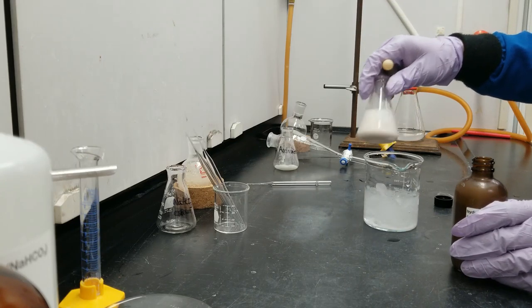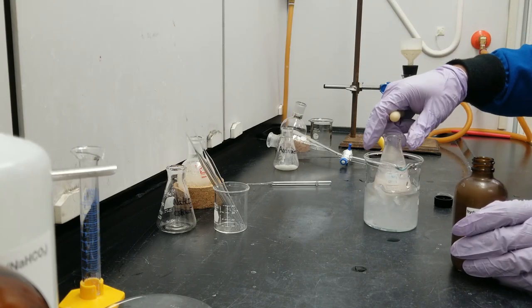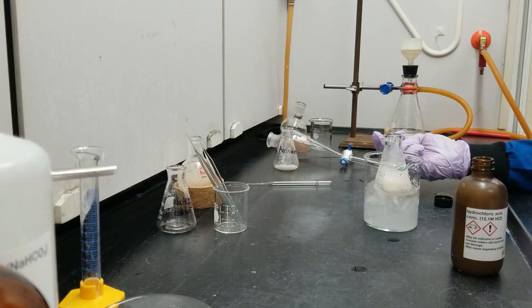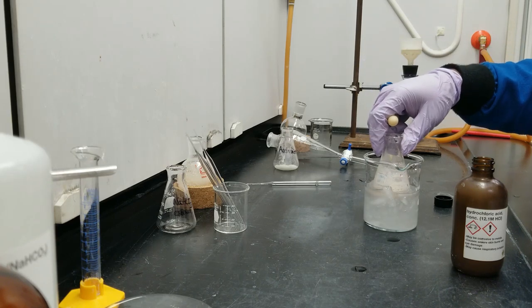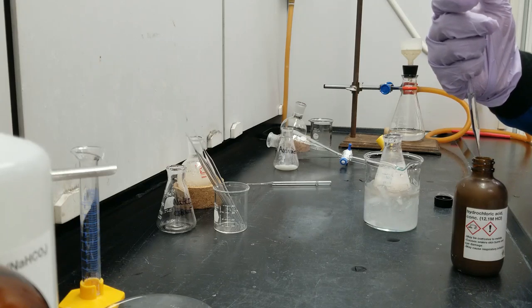Between each addition, give it a swirl and put it back on the ice bath, because the reaction between a strong acid, hydrochloric acid, and a strong base, sodium hydroxide, is very exothermic, so the heat might explode the glassware.